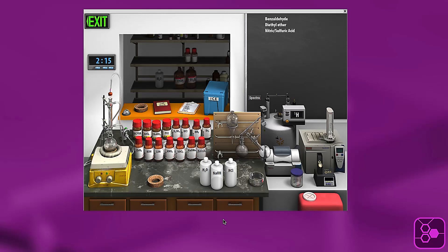Hi, this is Kelsey with BeyondLabs. Today I'm just going to do a little instructional video on how to do TLC in the organic lab to monitor the progress of your reaction.